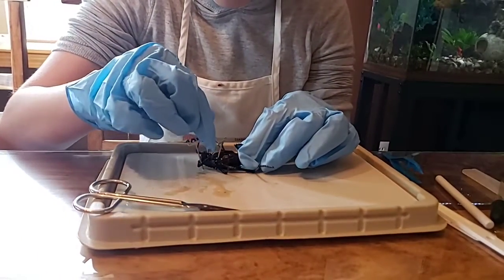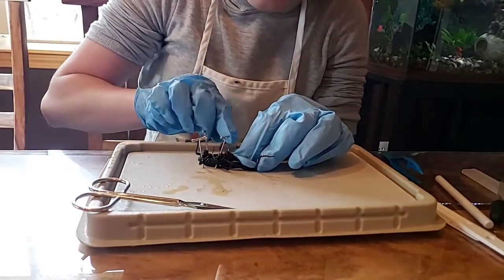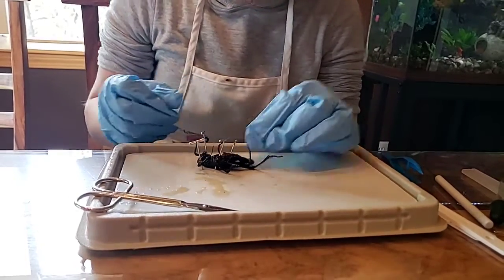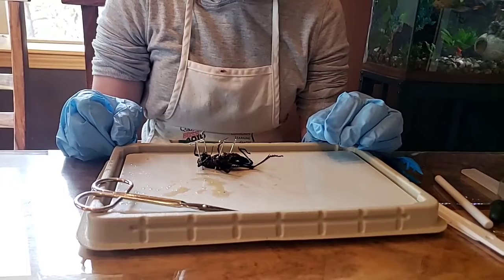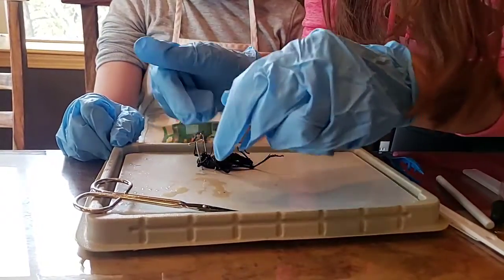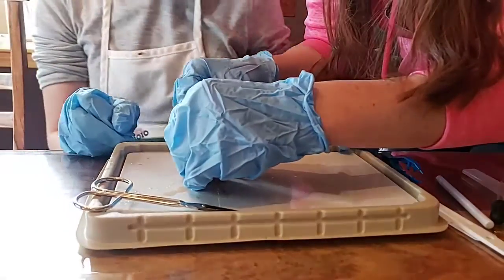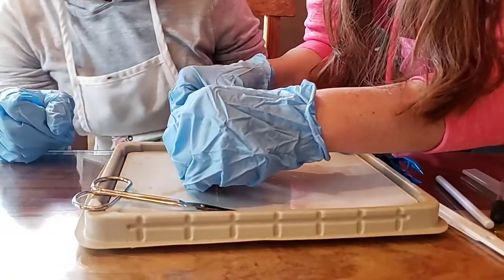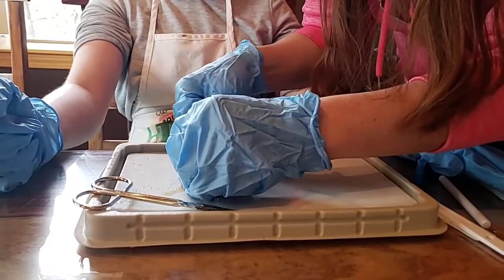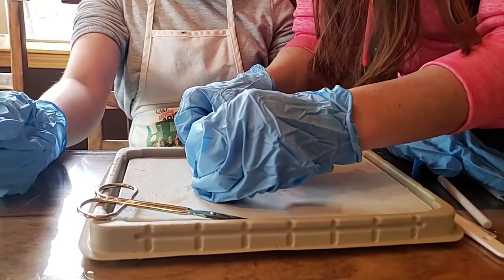Okay. So Lanston's got his open good. His is not preserved very well, though. His is a lot of brown mush, which is not going to be easy to see. I think you can see mine pretty well. Tan, I'm going to help you open yours more. Oh, yours is preserved better. All right, Tan, what you got to do is take this like this. We're going to take this little side out over here. There's one side. And you lay these down sideways so we can actually see into it. You don't pin it to the leg down.